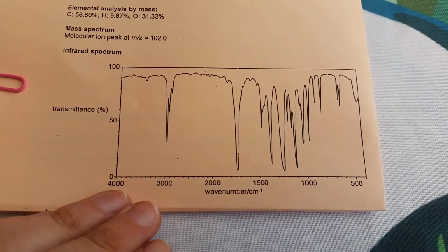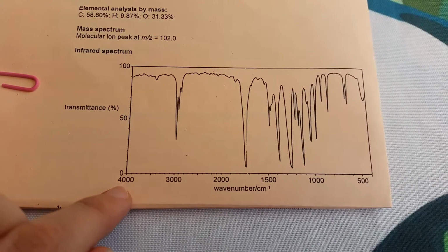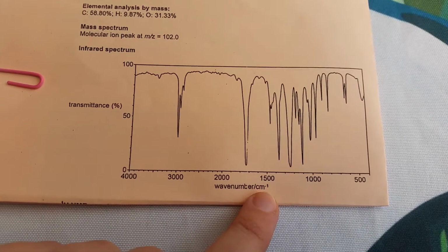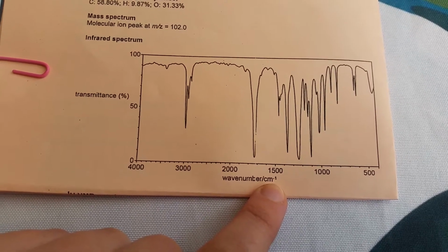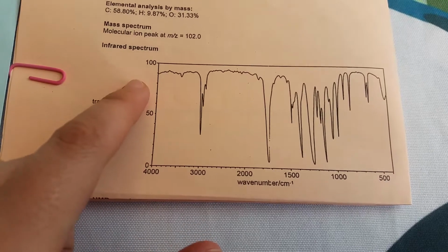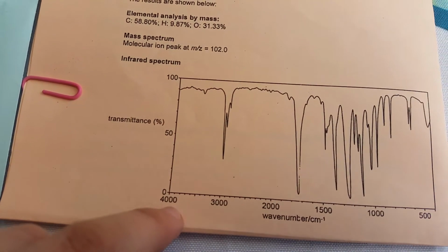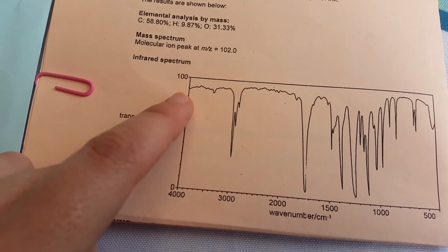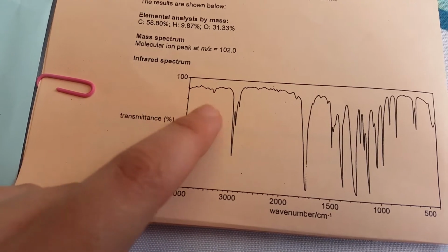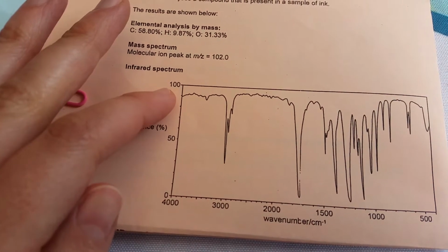Notice on the x-axis of wave number, we start from the bigger wave numbers and go down to small ones. And notice the units of wave number, centimeters minus 1. And transmittance is percent, and it goes from 0 to 100. So up here, you can see that at this wave number, not much radiation is being absorbed. Nearly all of it is passing through, it's being transmitted. Almost 100% is being transmitted.